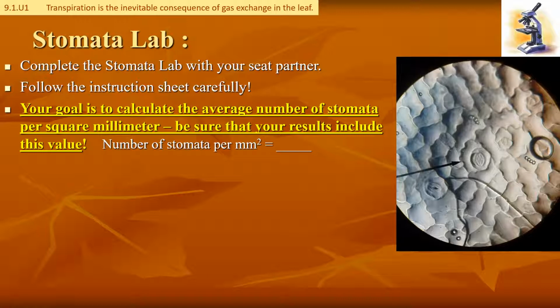So you're going to go through several calculations. These are laid out for you in the instruction sheet, and there's a place for you in your Google Doc lab report to be able to show your work and show your processing until you get to the final answer.